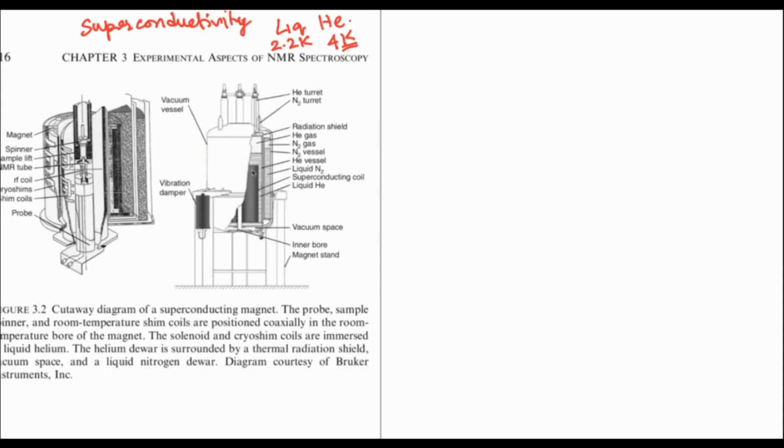What you see here is the solenoidal magnet, the black thing that you're able to see, and it's kept in a helium vessel. That's where the liquid helium goes. The liquid helium helps keep the superconducting magnet at the desired temperature. Immediately outside the superconducting magnet, there is a separation, which ensures that outside that you also have a liquid nitrogen bath.